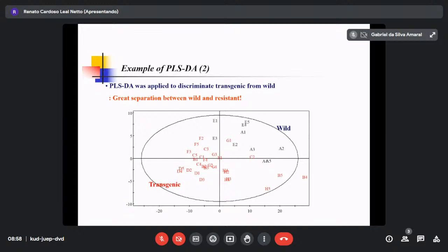Question? John, if you have one sample when performing supervised learning that is quite far, when you're modeling, you can analyze and see that when you perform the model without this sample, it enhances the performance of the model. Is it correct? Can I use this strategy, or can I exclude this outlier from my original data set?